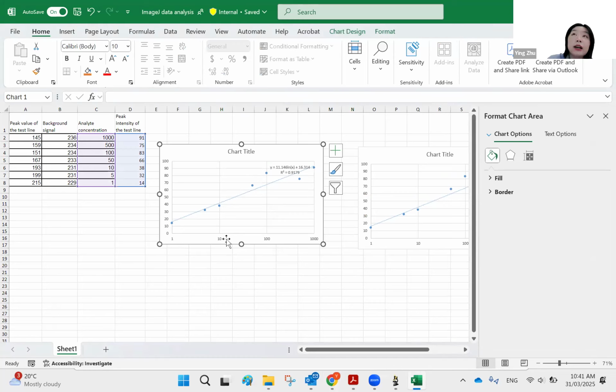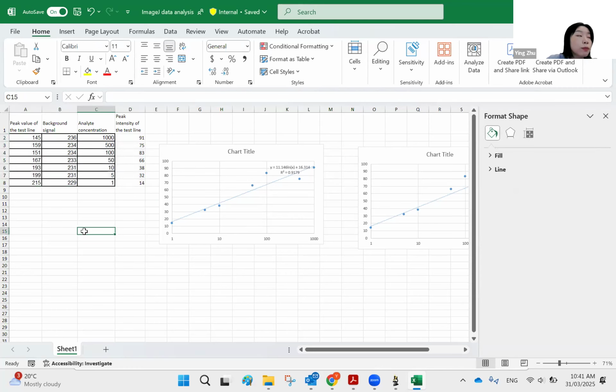And yeah, so now please just try image analysis and then see whether you can plot in Excel first. And then with that data, next week in MATLAB, we can do a proper plotting using MATLAB. Okay?